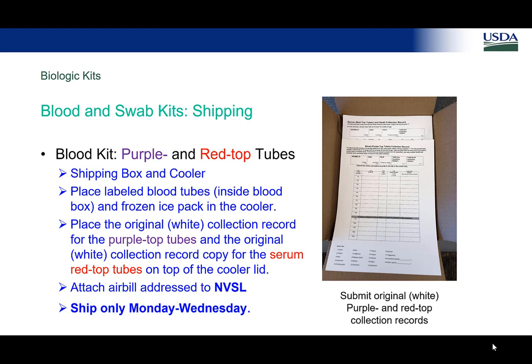I put the ice pack in the liner bag. Yeah. Sorry. Okay. So put everything in the liner bag here. I always put paper in the ziplock anyway. Yeah. It's not a bad practice. It looks like there's another bag. Again, this is the first time using these insulated bags. This was like, how are we going to make this work? So hopefully, you might want to add another piece of tape on there. And then seal it up.